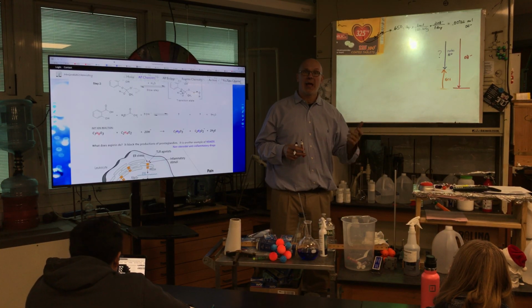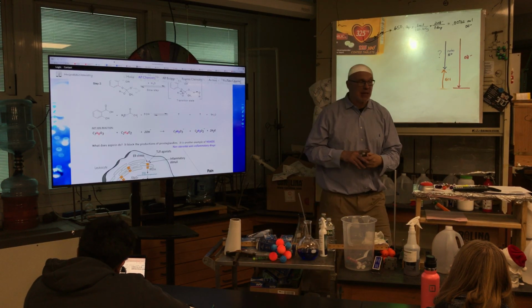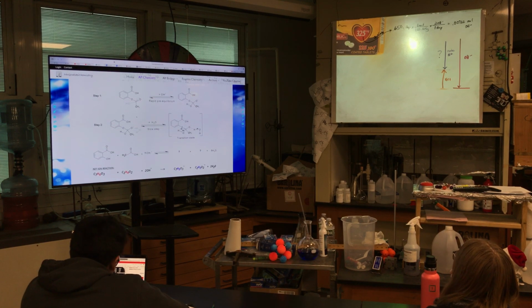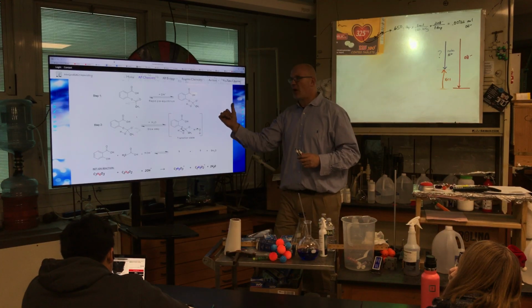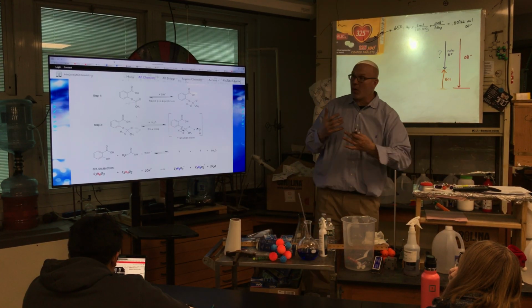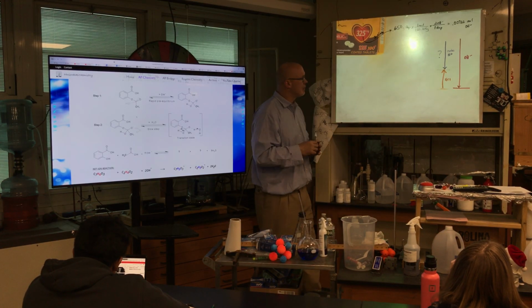We're going to have to add excess because what if there's more? But we need excess regardless because the design of the lab requires us to force, by Le Chatelier's principle, this forward. And as I said, it's a tablet. It doesn't dissolve. Having more of the solution of the base will dissolve it, okay?